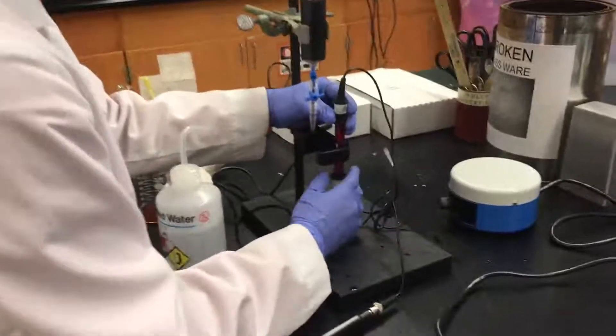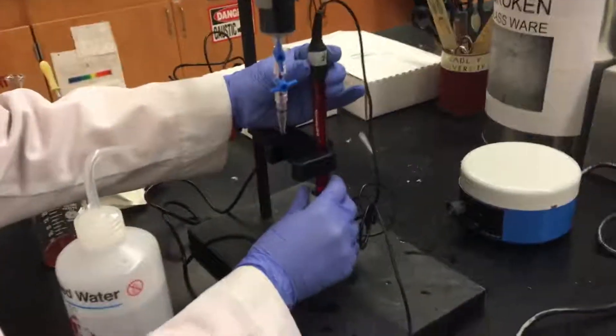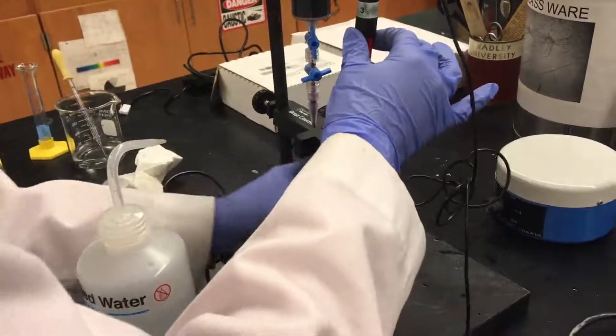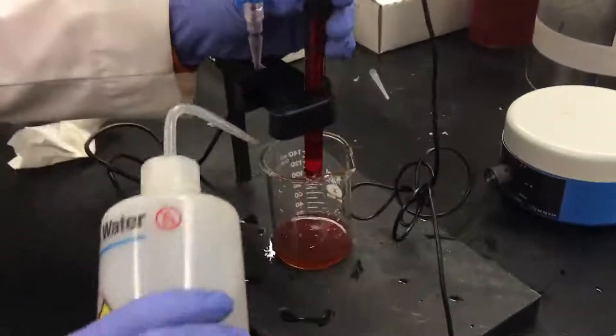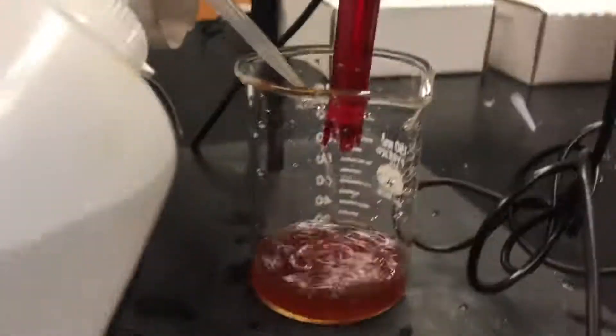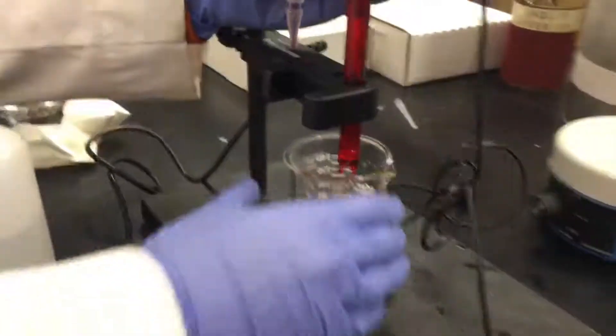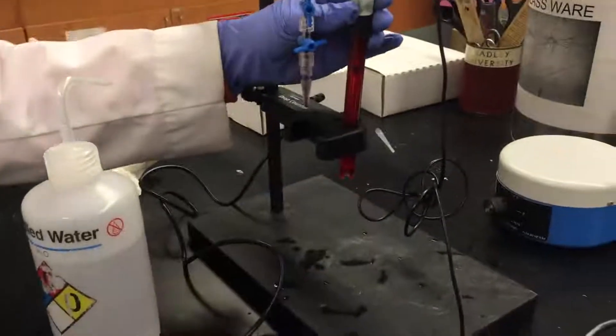So Eilish is now going to take the redox probe out of its buffer solution and place the waste beaker underneath it and clean it off by using DI water. So we want to clean that glass bulb on there just to make sure that the buffer solution doesn't interfere with our titration.